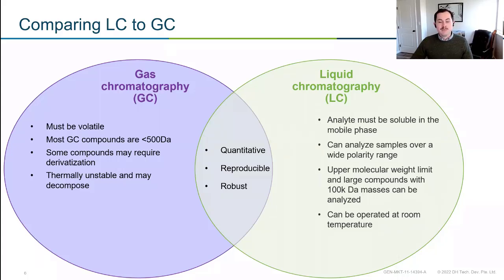Additionally, for GC analysis, we're typically talking about relatively small compounds, most of the time sub 500 Daltons. My background is in environmental science, so that's the area I deal in. But I know many of you study things like polymers and proteins that are much, much larger. GC might not be a great approach for those larger compounds. It really isn't, compared to LC, where we can look at some really large compounds, things that are 100,000 Daltons instead of just 500 Daltons. But regardless of which approach you take, which one's right for your sample, both are quantitative, robust, and reproducible. They've been around for a long time, and we use them all the time in the lab to complement each other.